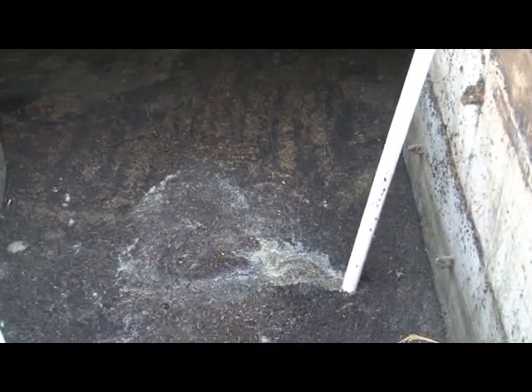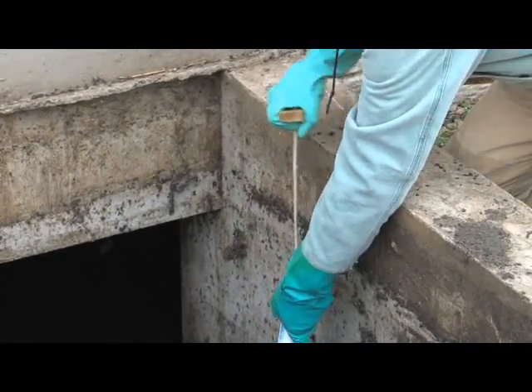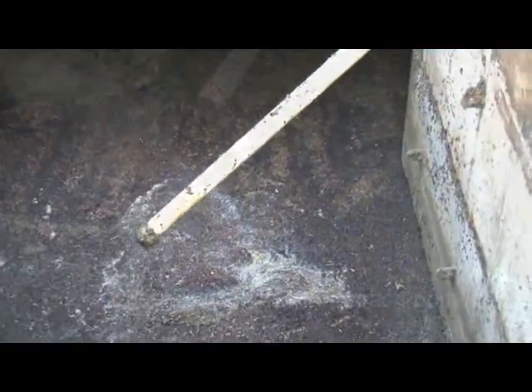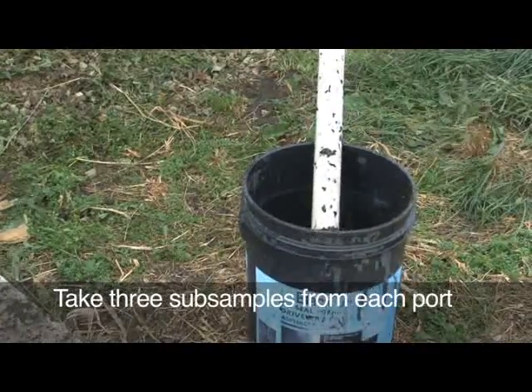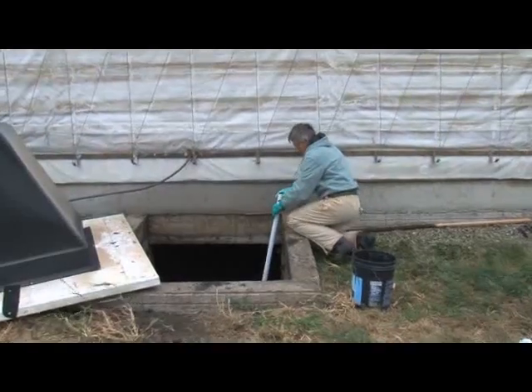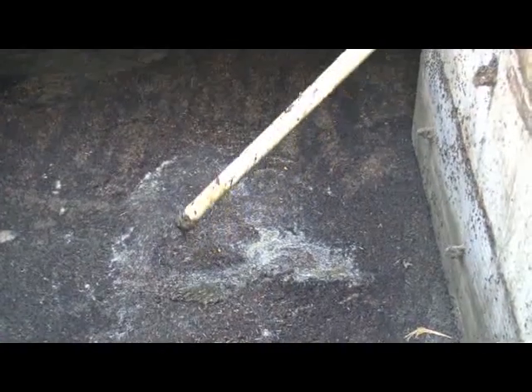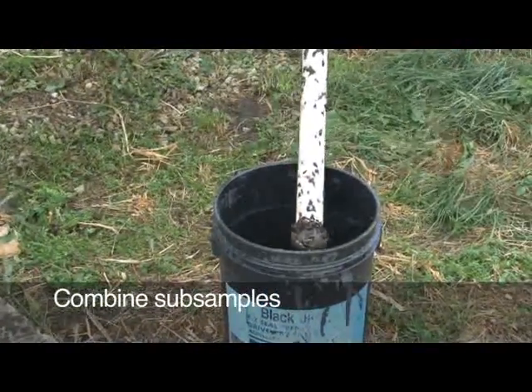Taking one sample is similar to taking one soil core when soil sampling, so it is necessary to take subsamples from at least 3 locations within each pump-out port. After 3 subsamples have been taken from one port, move on to all remaining ports and access locations, repeating the process of mixing and taking 3 subsamples.